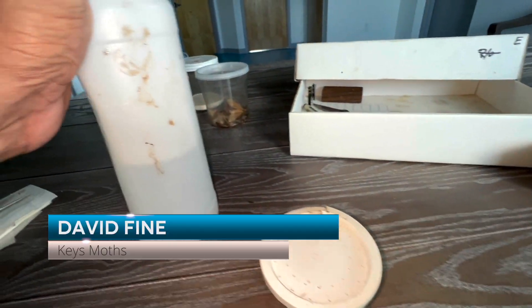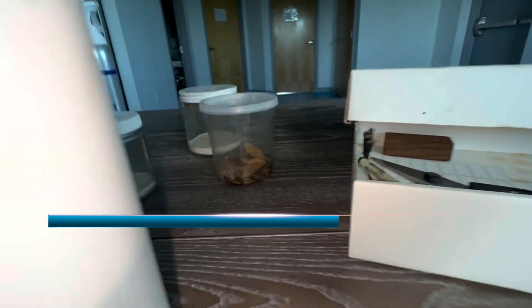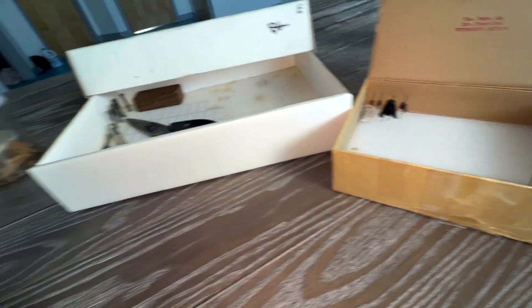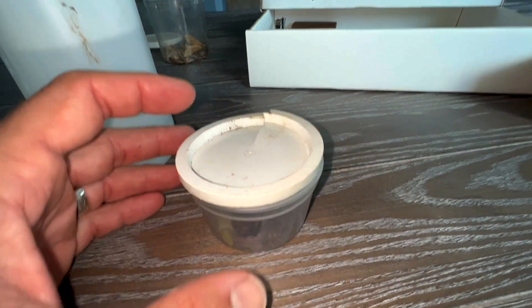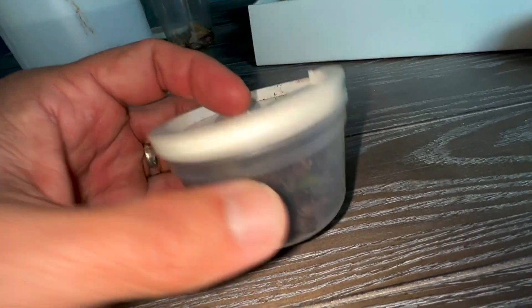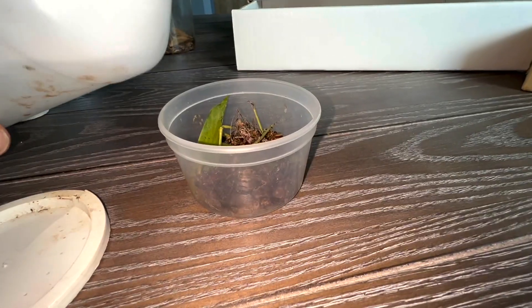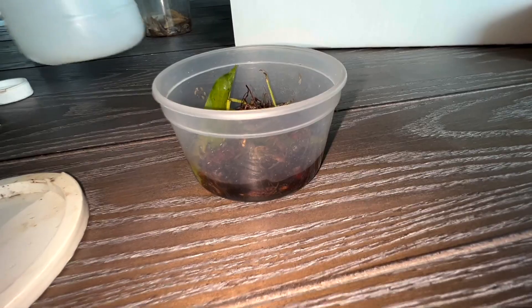Okay guys, so we've got a number of insect specimens and moth specimens from our traps last night. What we're going to do right now is properly take care of them so that we have the best specimens possible. These are all our beetles and flies and whatever little bugs. I've got some rubbing alcohol and I'm just going to put a little bit of rubbing alcohol in this mix here.